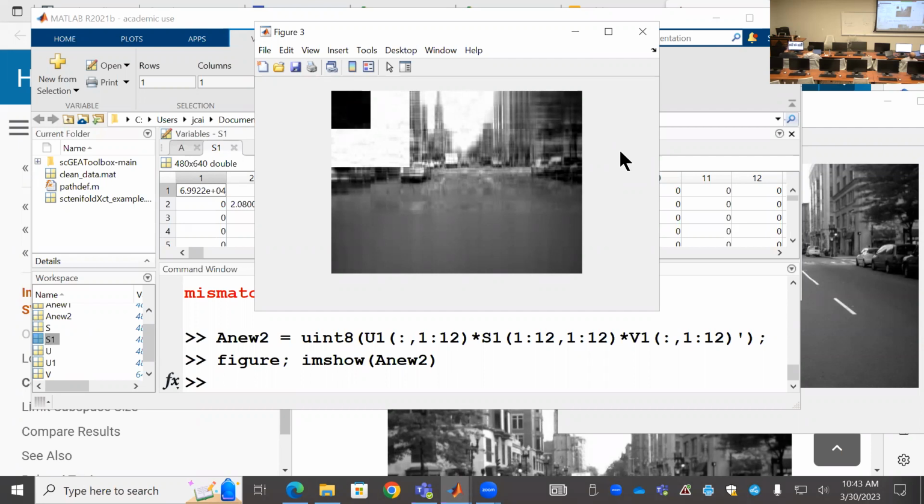I had a typo in my original code. I was just checking different numbers. It looked really blurry, so maybe try 24 or something else. But the major components are already reconstructed.